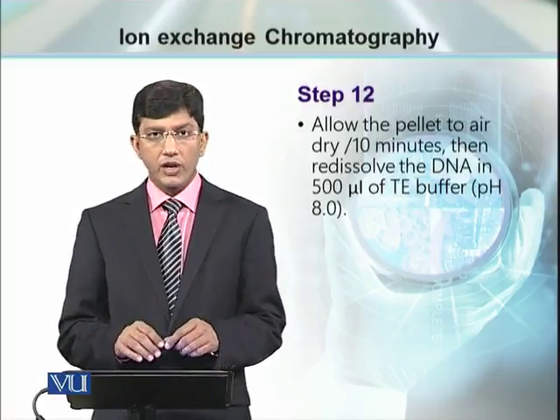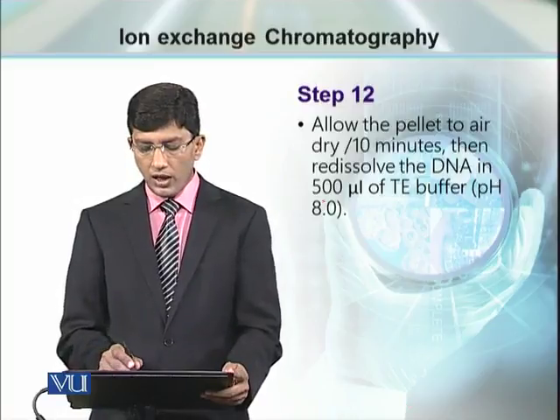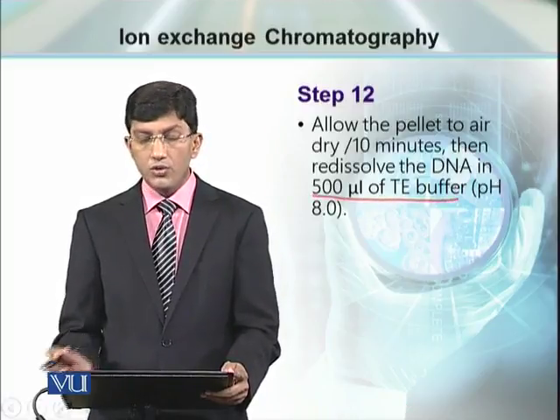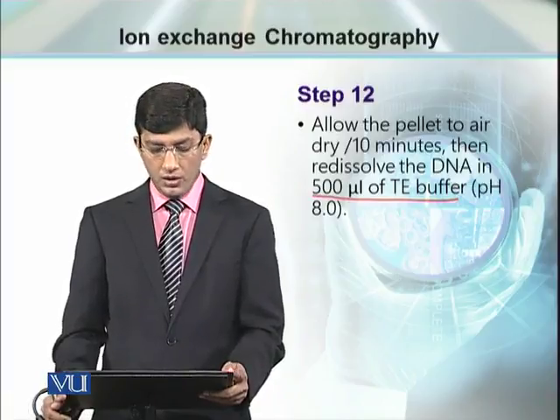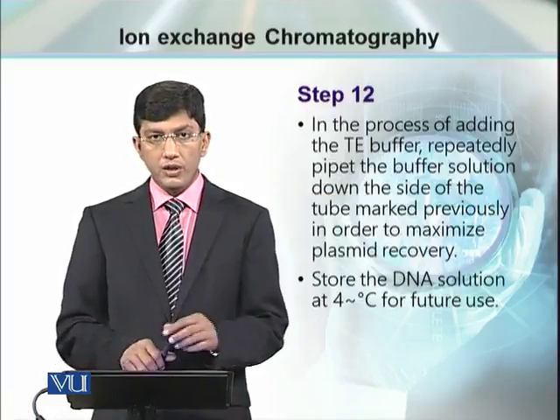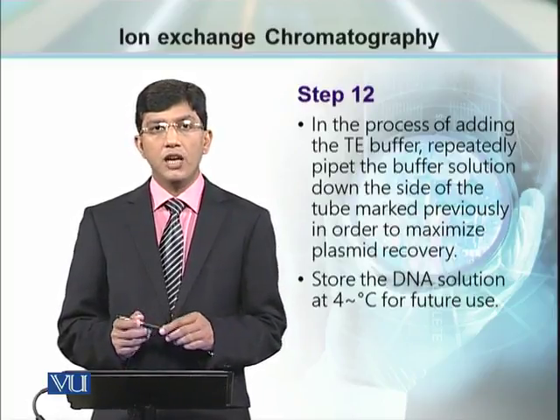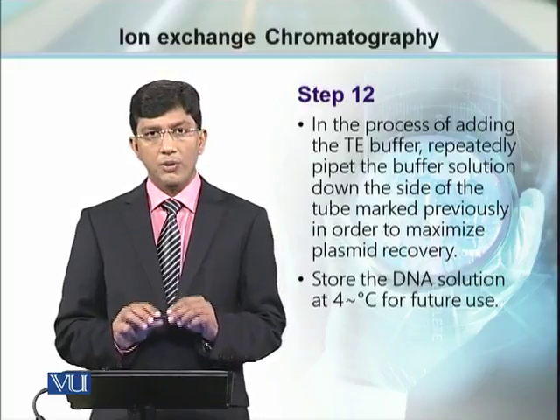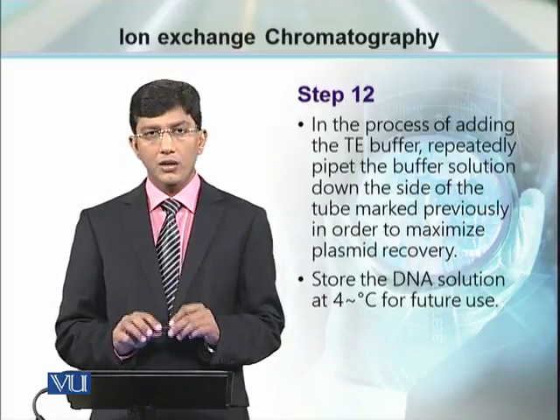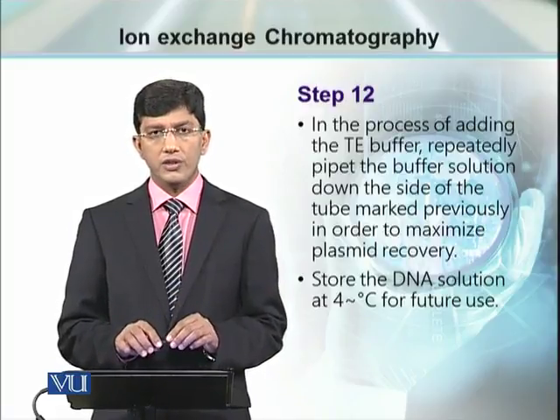Allow this pellet to get dry, and once this pellet is dried, we can redissolve this pellet in 500 microliter of TE buffer. After using this TE buffer and after pipetting multiple times, the plasmid DNA is completely eluted and is now ready to use for further experiments.